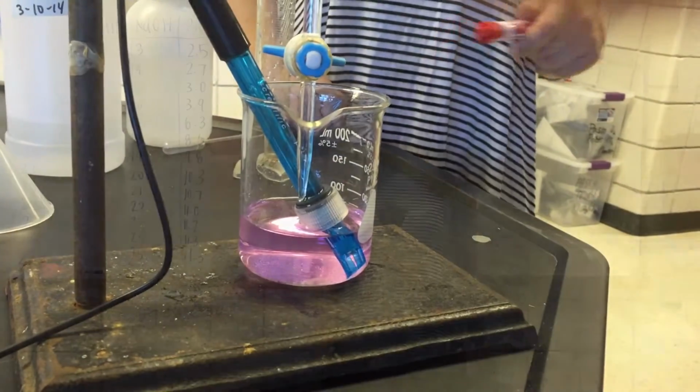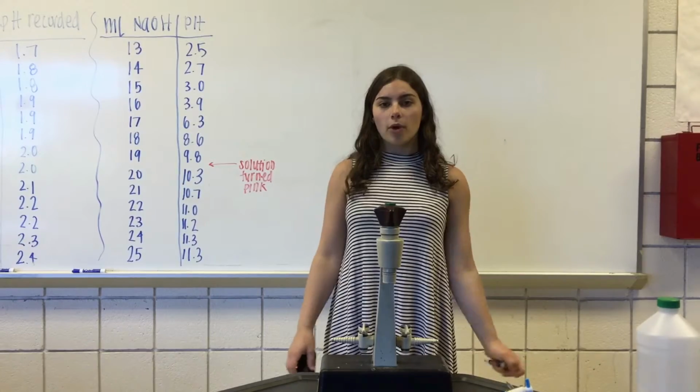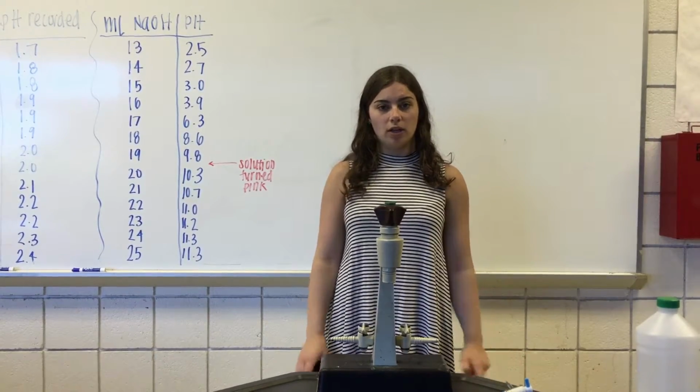This is the final solution. We're now going to plot the pH versus milliliters on a graph.